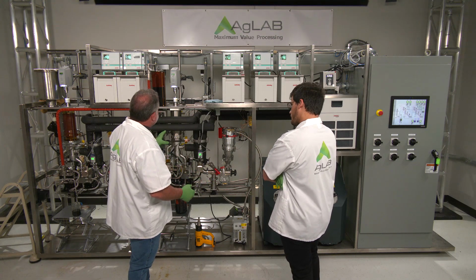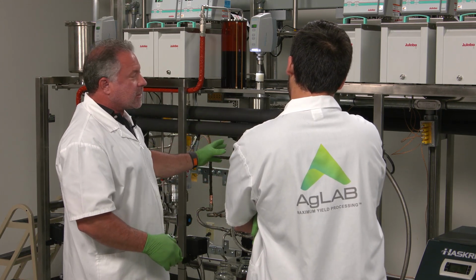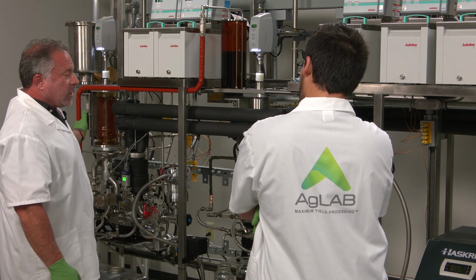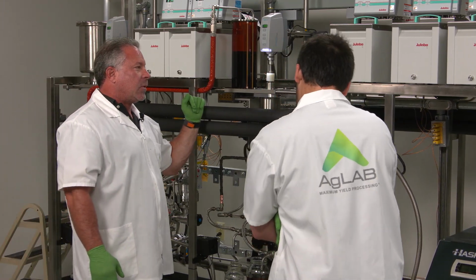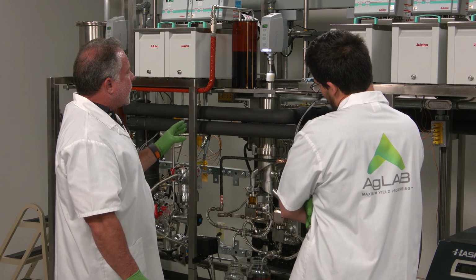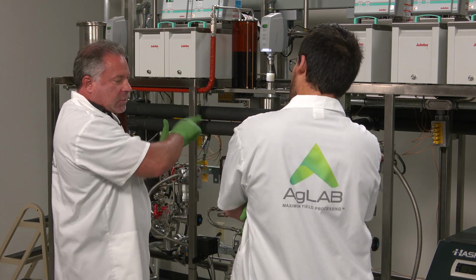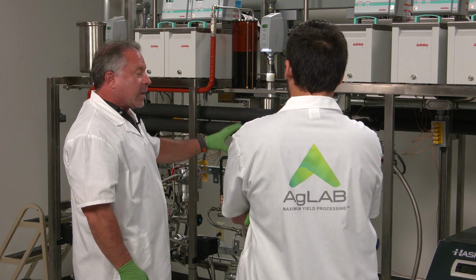One of the things that we're looking at when we have this system set up at this type of vacuum is molecular distillation. So the difference from this stage compared to our first stage, when we're doing our terpene strip, is that there we're using temperature as our gradient to show where the molecules can go. This one, we're looking more in the realm of concentration. So when you're looking at any type of reaction, the driving force goes from high concentration down to low concentration, right? That's the transfer of energy for that. That's what's going on here. So we have high concentration.